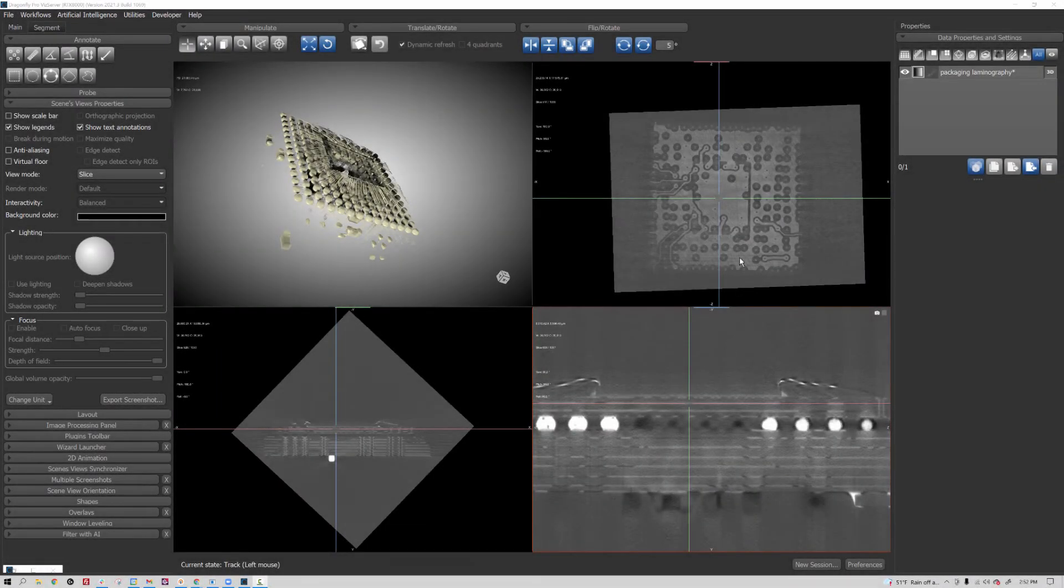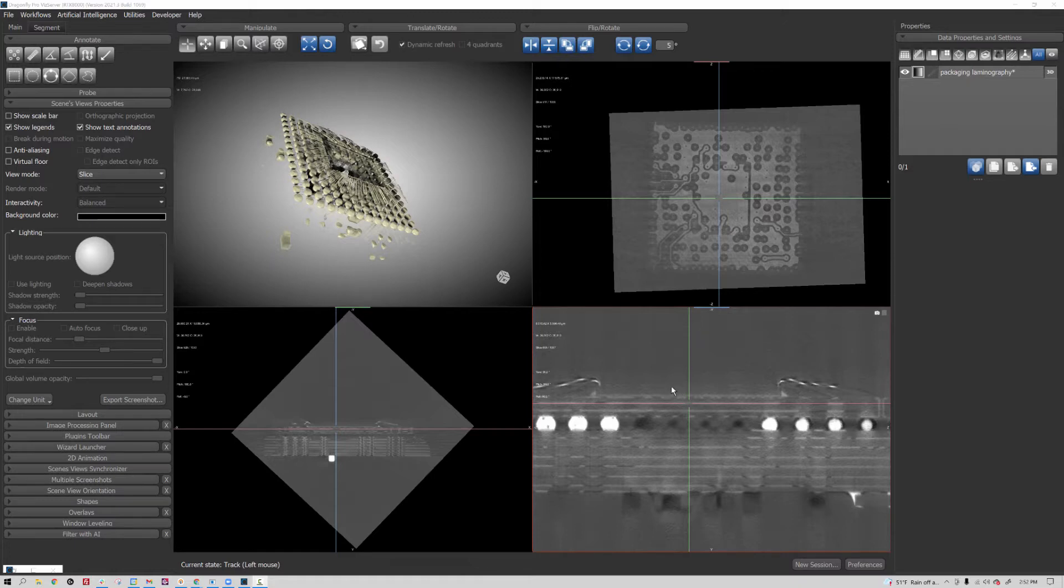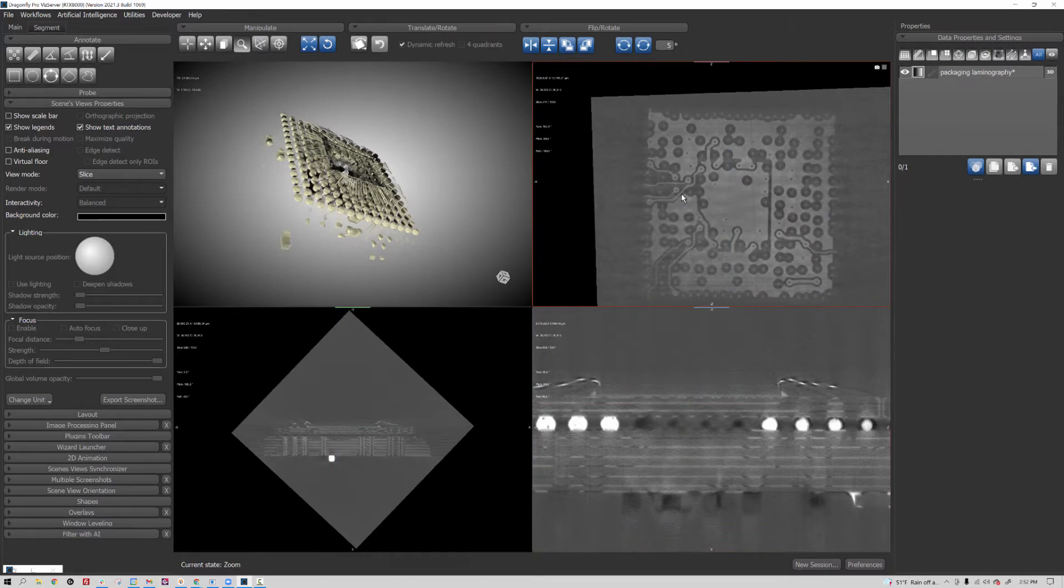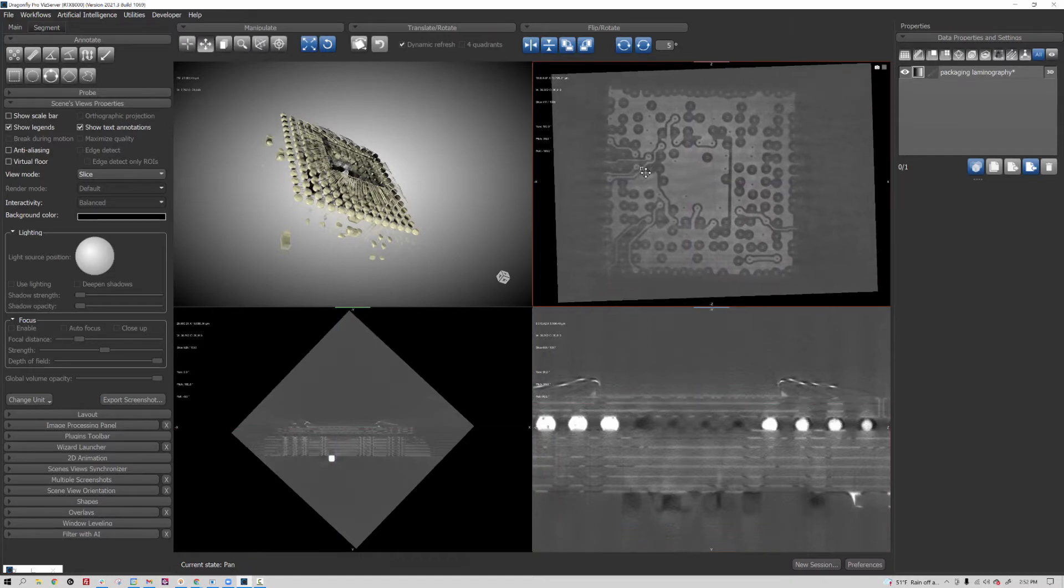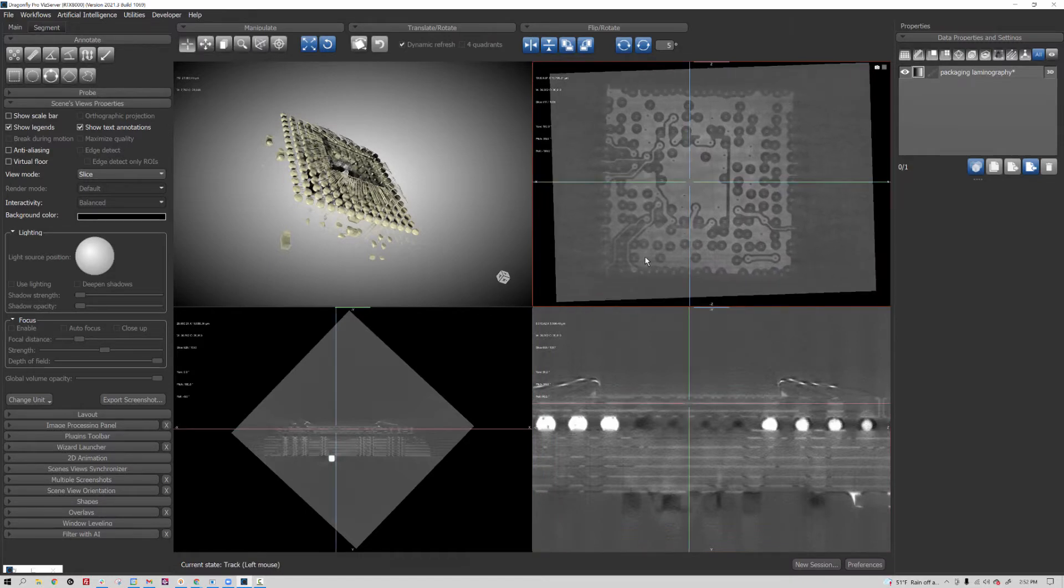I have this small PC board with electronics packaging imaged by x-ray laminography. When I rotate it and look at the planar slices, I can see the features on the different planes, but even when I do my best job of aligning it, I don't get a sharp image across the full width of the plane.